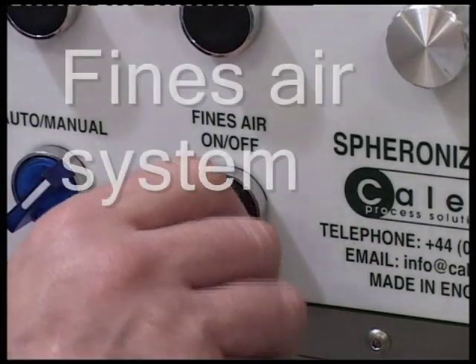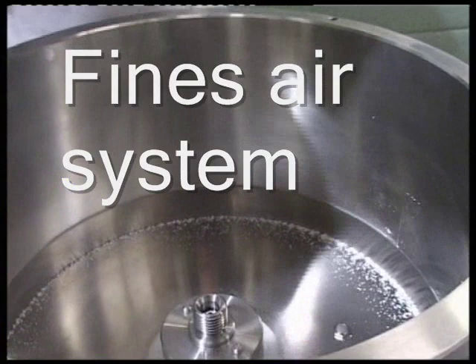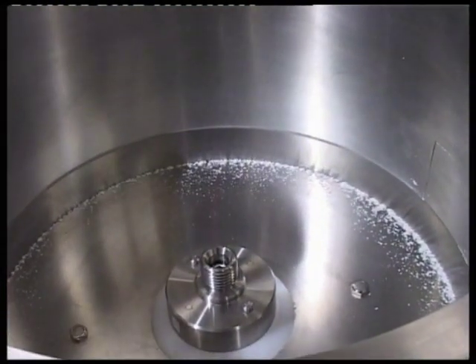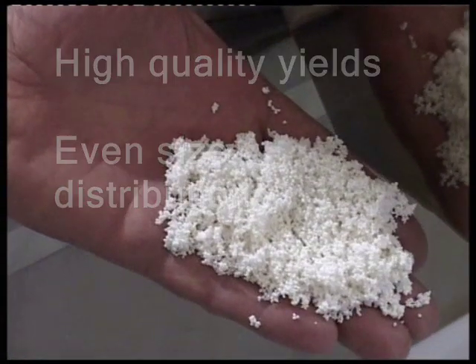Also available is a Fines air system designed to minimize dust falling between the disc and drum. The Spheronizer 500 producing high usable yields with even distribution of sizes.